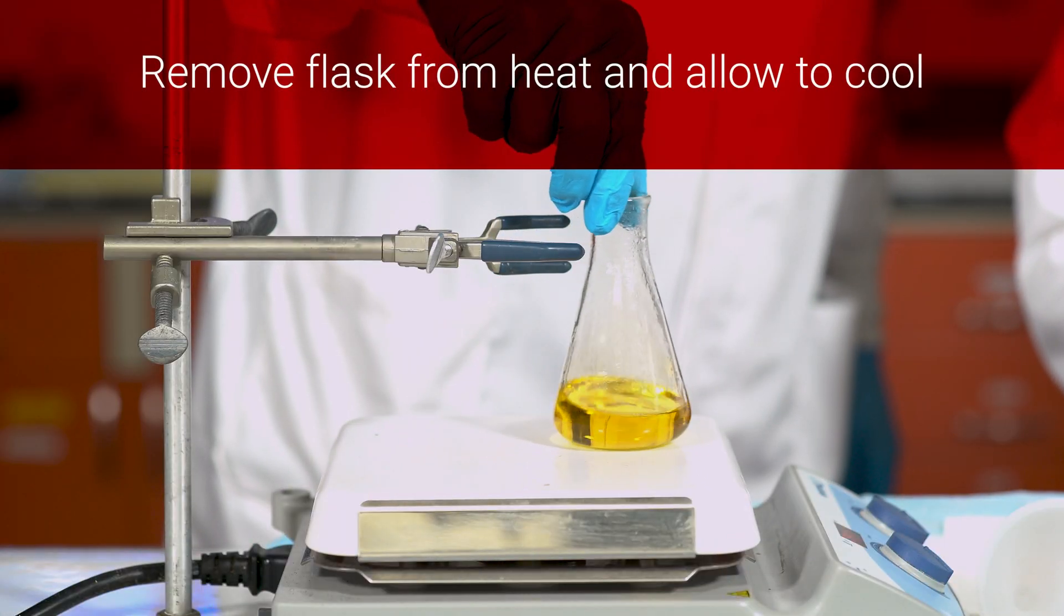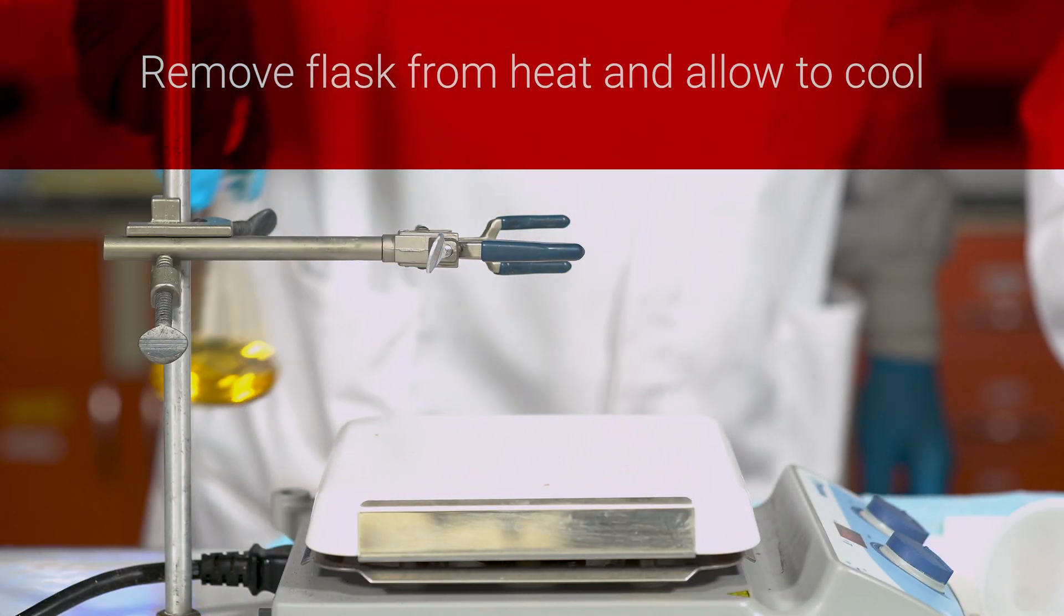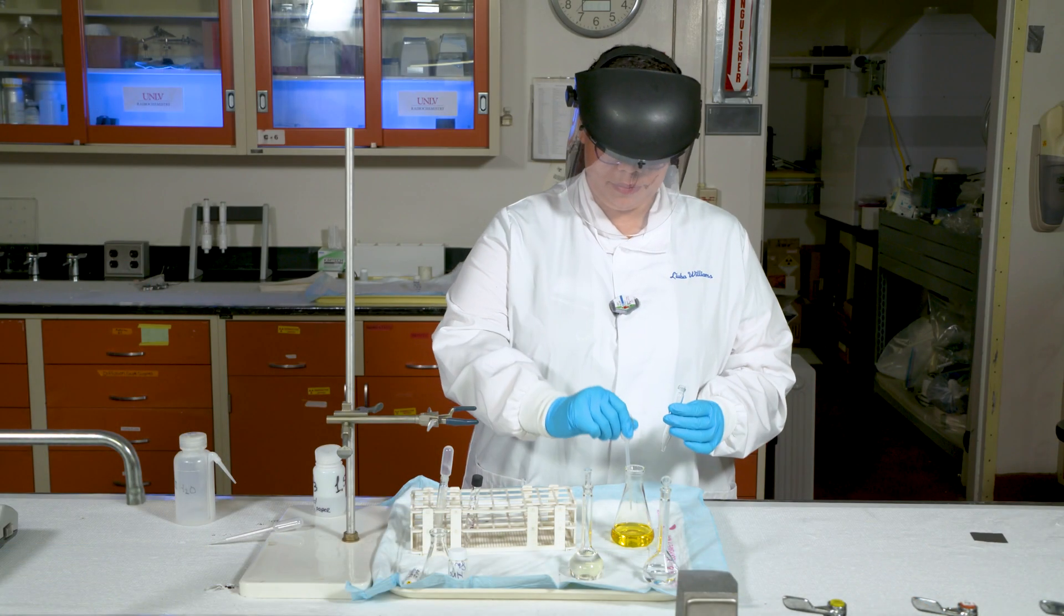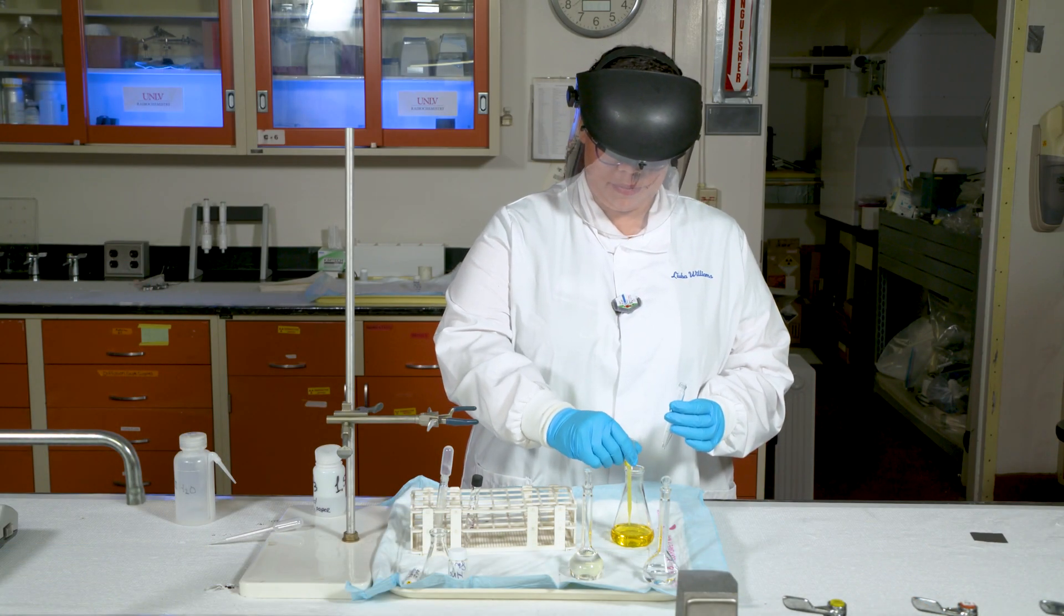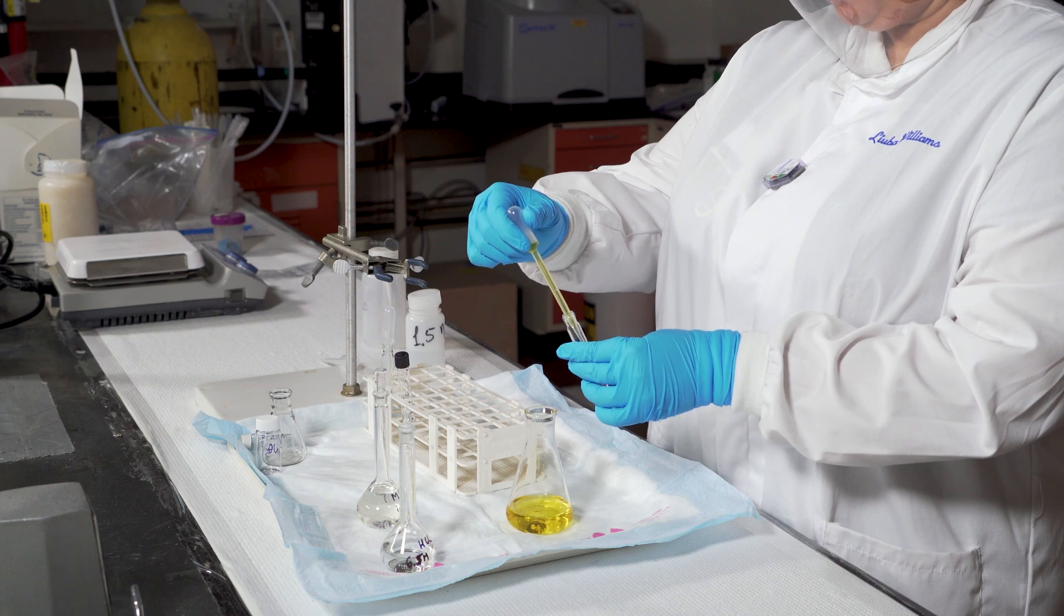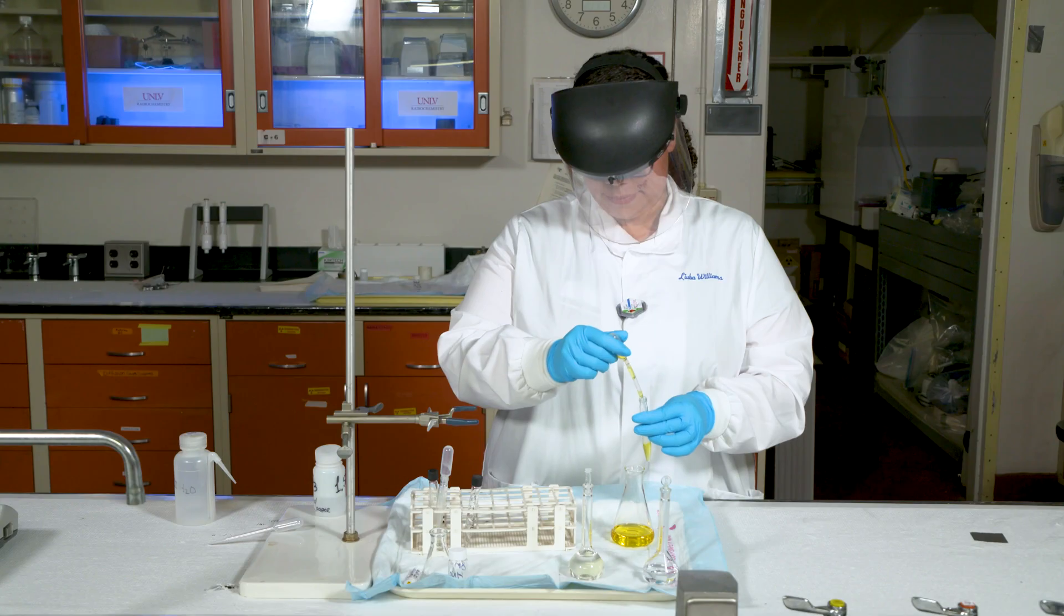Once the sample has reached this yellow color, the flask can be removed from the heat and allowed to cool. A portion of the cooled uranyl nitrate was added to a glass centrifuge tube with 30% tributyl phosphate in dodecane.